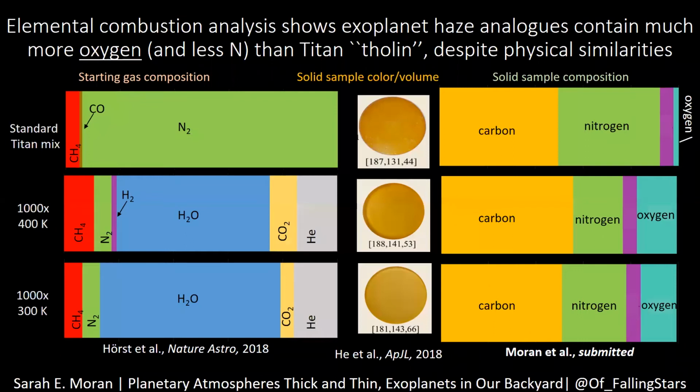However, we then did combustion analysis just to get the bulk composition of the haze particles that we made, and you can see that they vary quite a lot, mainly in terms of the nitrogen and the oxygen. So these two cooler ones have way more oxygen in the solid products than does the Titan haze particles.